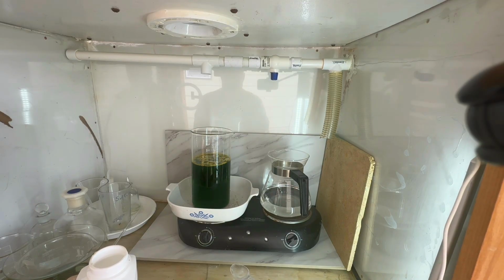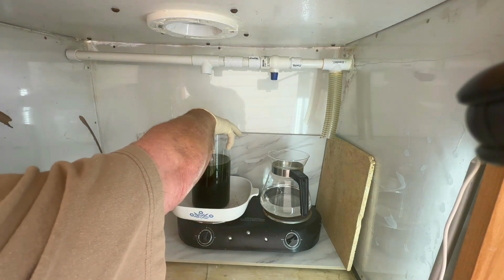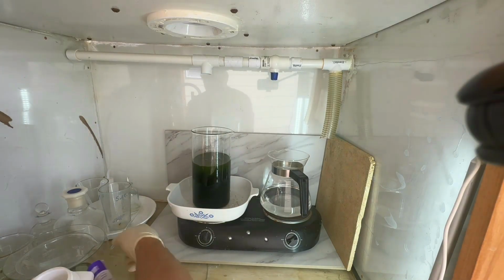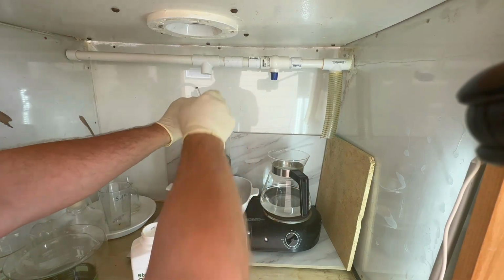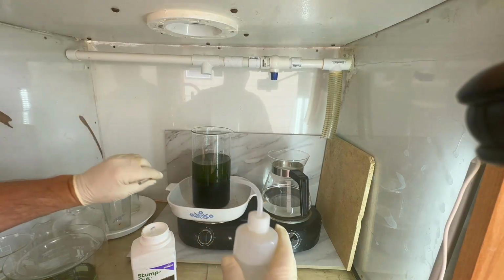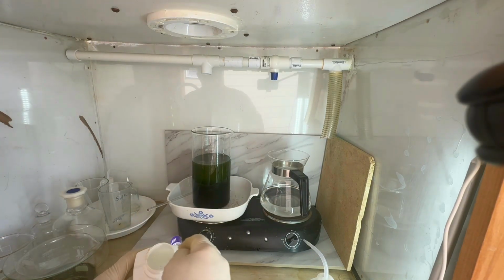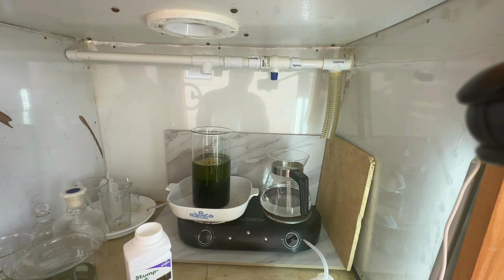It's not that unusual for these dirty solutions to foam up. It's generally not the pretty drop that you see with a nice clean solution. That's extra base metals, etc., and they're causing problems. I like to let them settle down before I go too far, because it's hard to really tell when the Stump Out itself, or the SMB, is just settling on the bottom. I'll do one more teaspoon here, stir it in, and we'll give it a test.